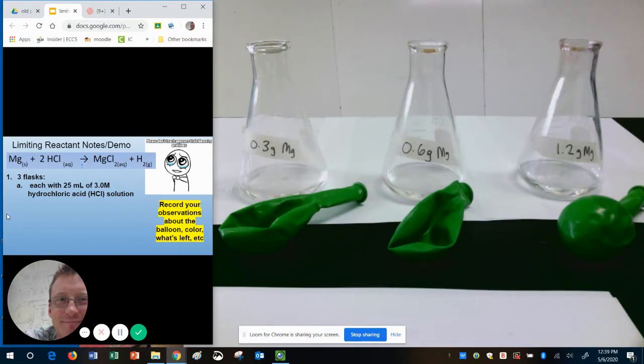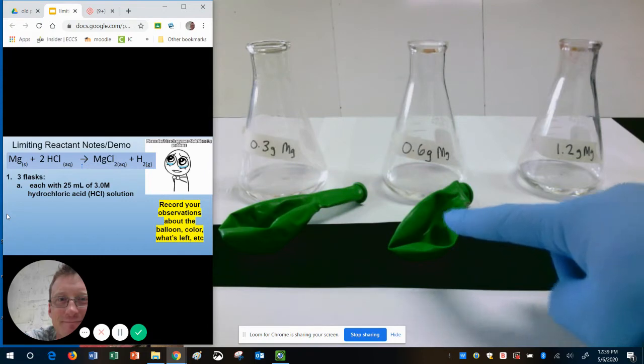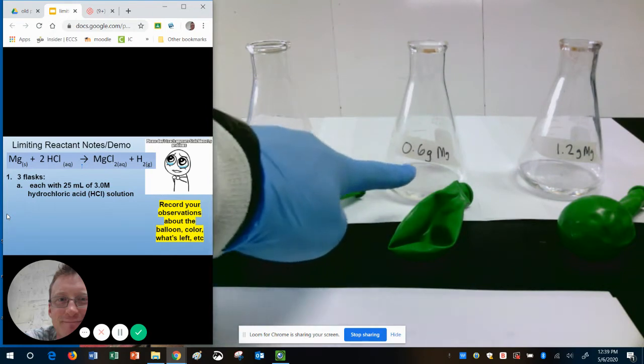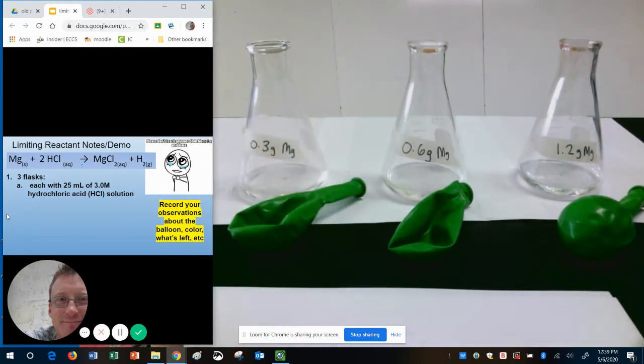In each of these balloons, we have magnesium powder. And the amount of magnesium powder is given to us on the tape. So I have 0.3 grams in the first balloon, 0.6 in the middle one, and 1.2 grams of magnesium in the third.